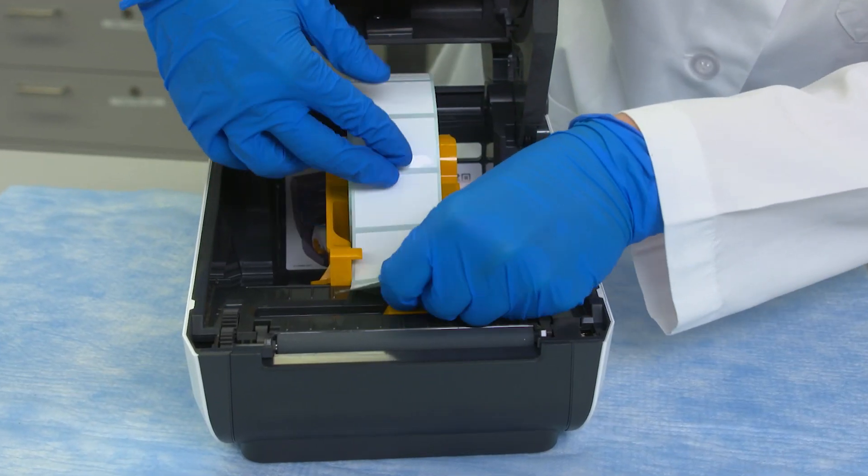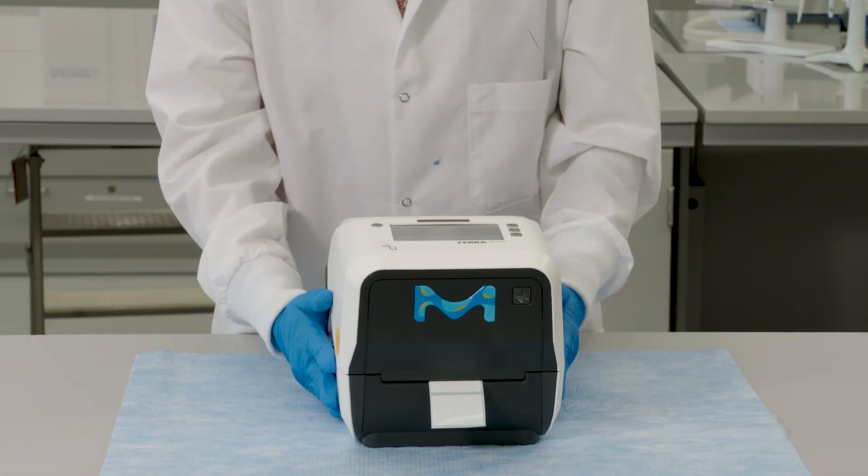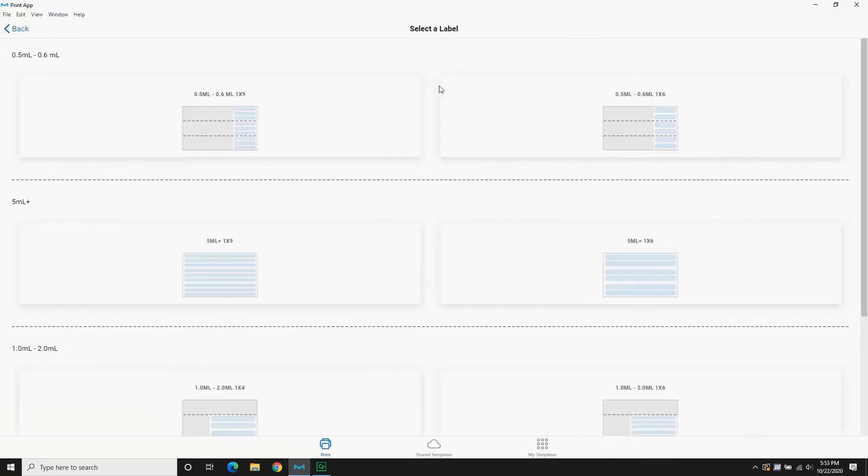The thermal transfer printer is small, compact, and easy to use. USB or Wi-Fi connection options allow for flexible setup of the system.